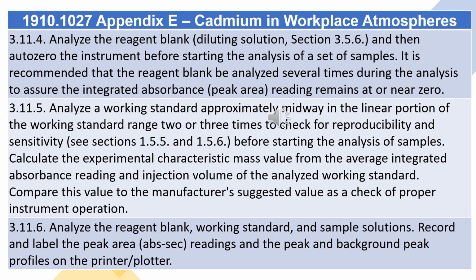3.11.4. Analyze the reagent blank, diluting solution, section 3.5.6, and then auto-zero the instrument before starting the analysis of a set of samples. It is recommended that the reagent blank be analyzed several times during the analysis to assure the integrated absorbance, peak area, reading remains at or near zero.